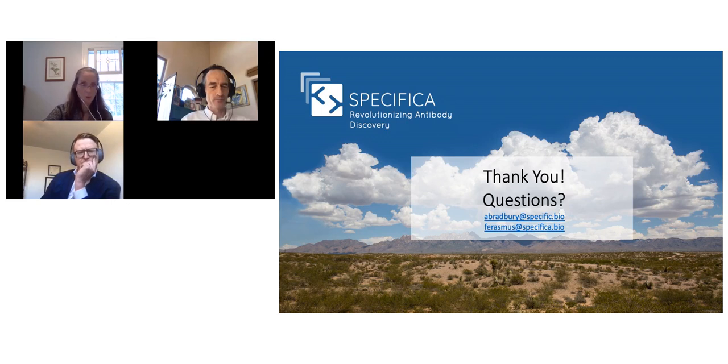Okay, I think we can get one more question here. Can you rediscuss Sanger versus next generation sequencing in terms of sequence coverage? Hopefully I'll address this right, but the way we think about Sanger is on a plate with colony picking, so 96 at a time, close to 100 at a time, and then every single plate is about $850 up to $1,000 depending on how you look at it.